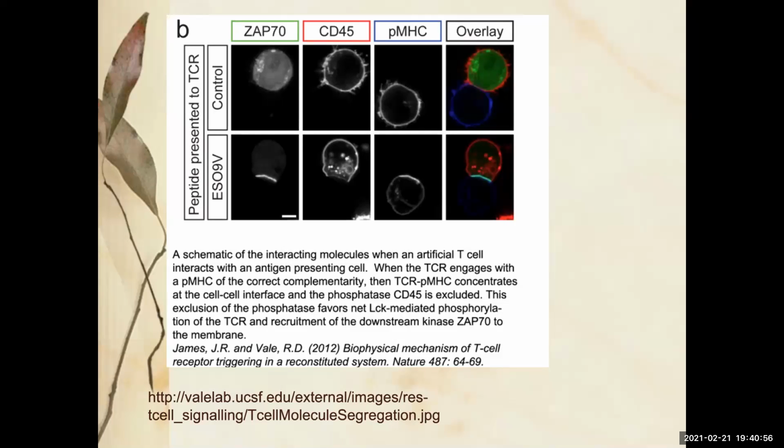But when I say, give me the image of the T cells, you're going to give me this. You're going to give me all 4. You're going to show me channel 1, channel 2, channel 3, and then the overlay. And that's what you're going to get to do in lab. And in general, know that image has a broad meaning. It could be just this panel of your figure, or it can be this whole thing. Image can be many things, basically. It's a loose word, just like saying bright field. It can mean many things.